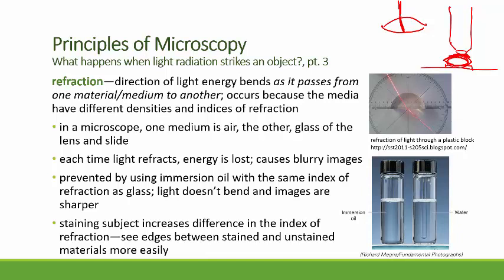So now we have glass, immersion oil, glass again, and there is no refraction at that point.